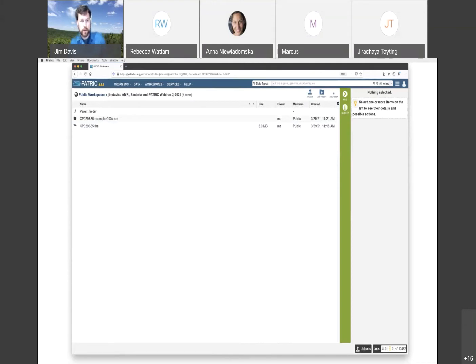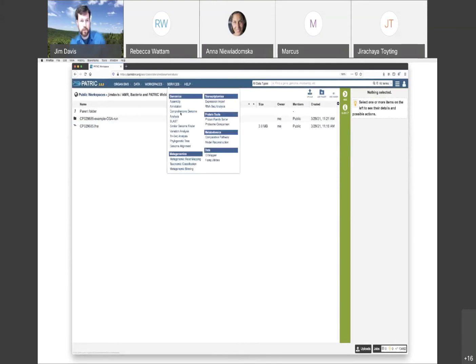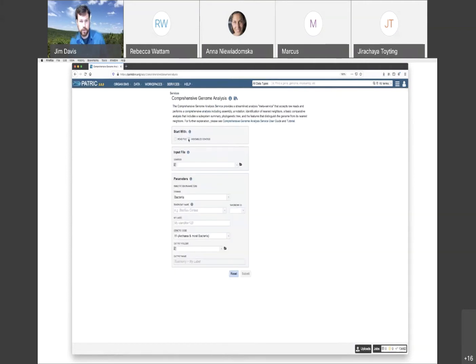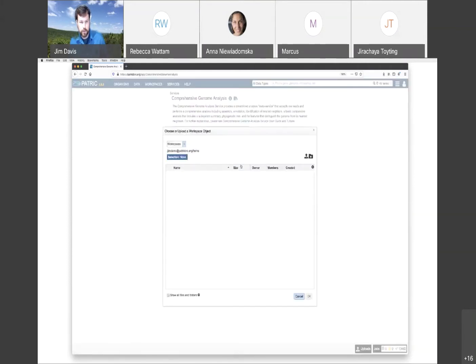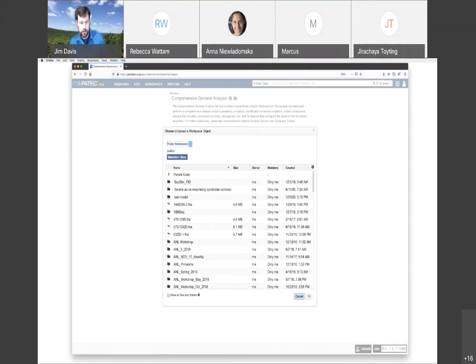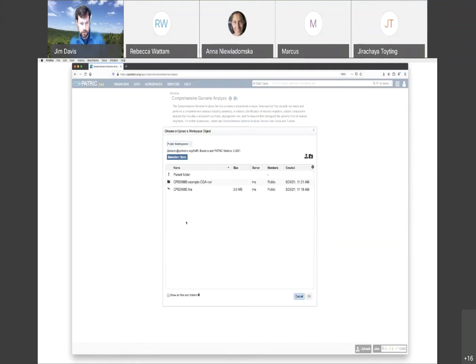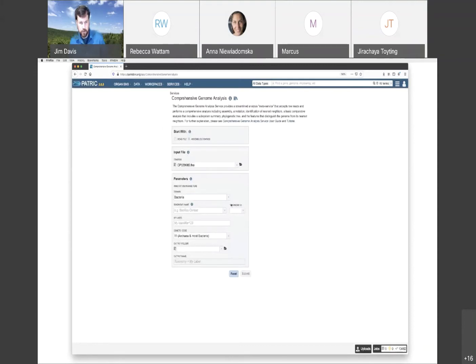And now I'm going to go back to the services, comprehensive genome analysis, assembled contigs, and I'm going to pick public workspaces, AMR, bacteria and PATRIC webinar, and then this guy. There. I think that was the problem.